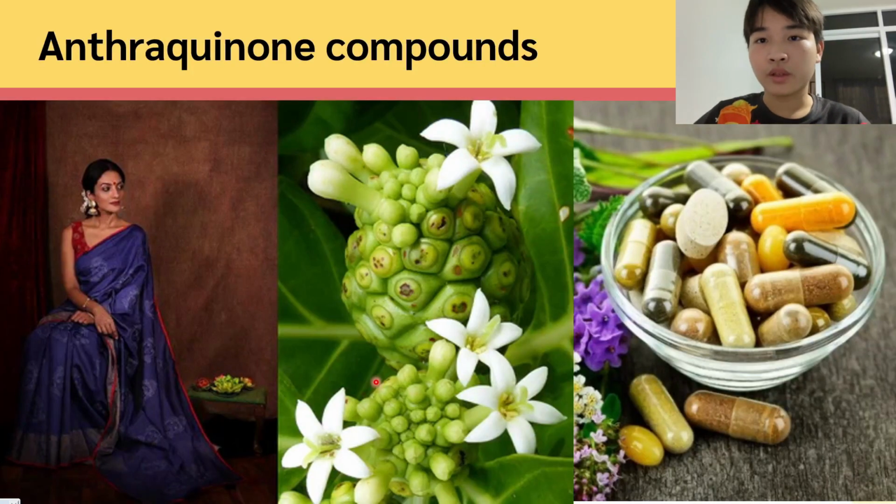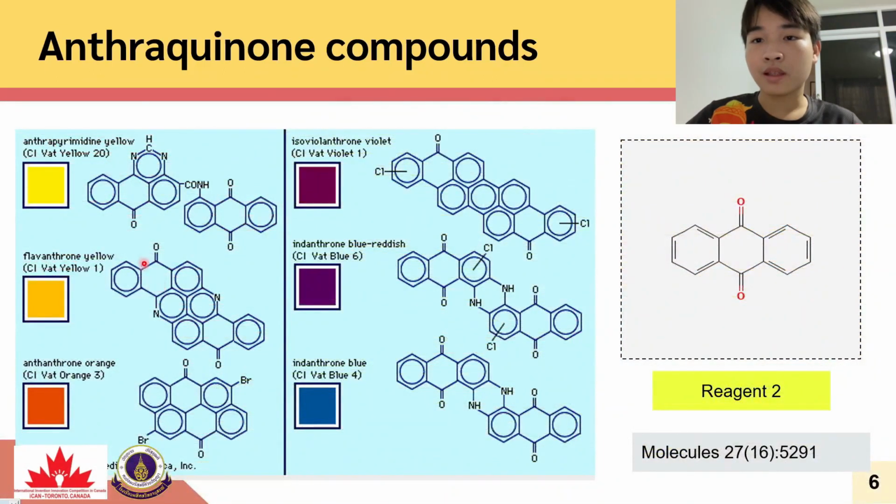To create a visual detector for alcohol content, anthraquinone is one potential substance. Besides currently being studied for medical and pharmaceutical benefits, it has been used for a long time as a natural dye. Derivatives of anthraquinone, despite their structural similarities, are often seen in different colors to the naked eye, especially if dissolved in different organic solvents and acidity.